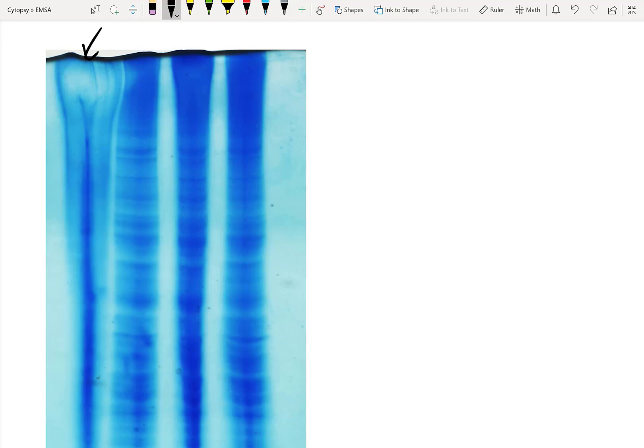Our next step is to prepare samples. But before I get into the equilibration and how you actually dilute samples, I want to talk really quickly about native gel electrophoresis versus SDS polyacrylamide gel electrophoresis or SDS-PAGE. In our case with EMSA, we're trying to see if a particular DNA wants to interact with a particular protein.